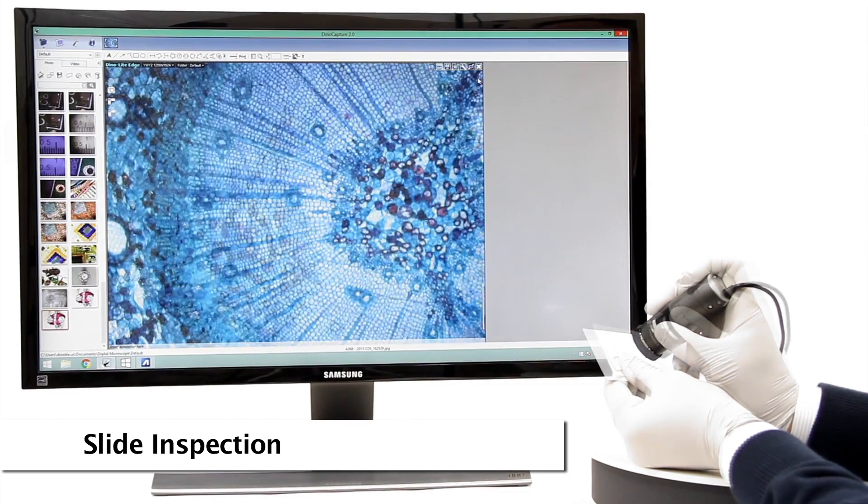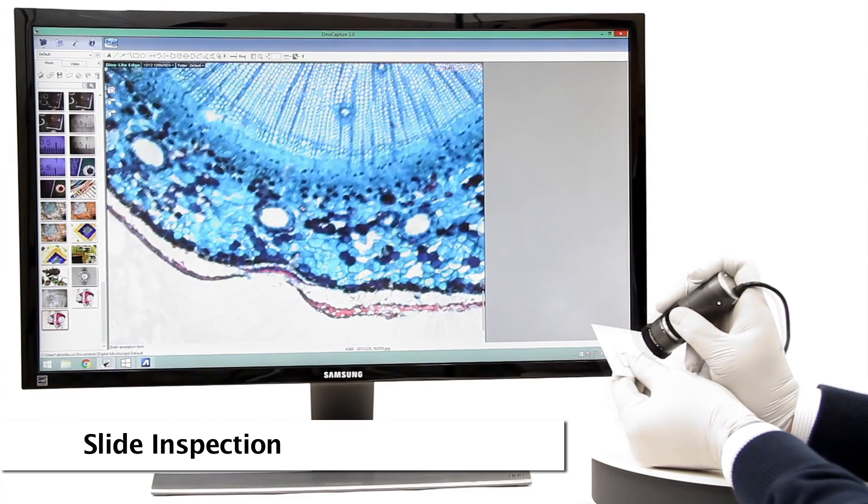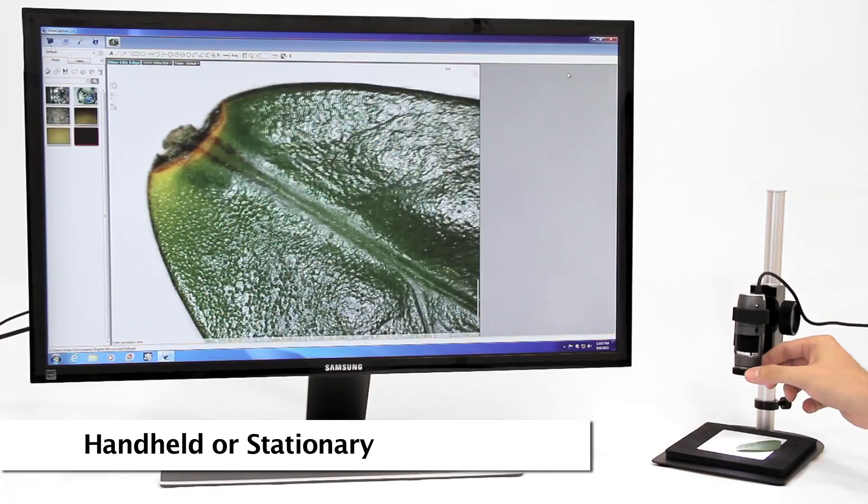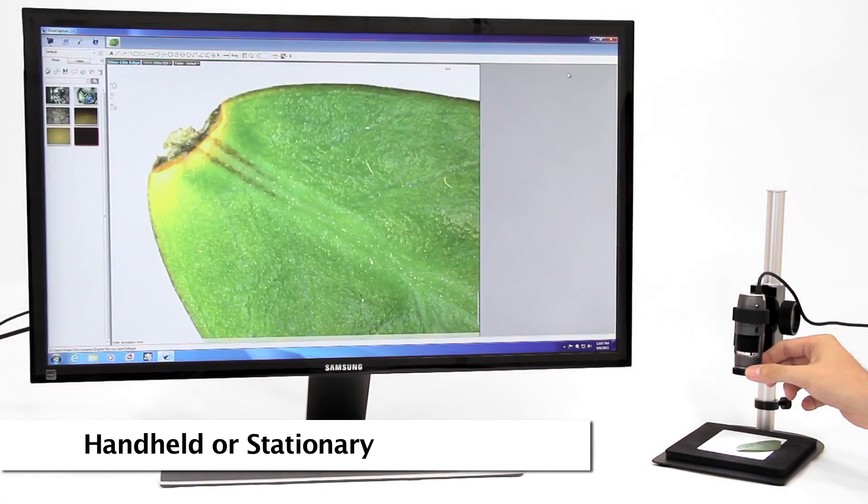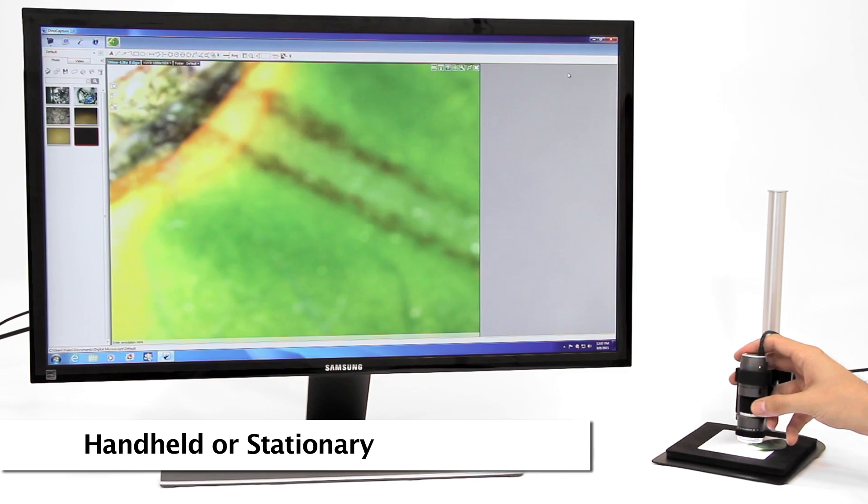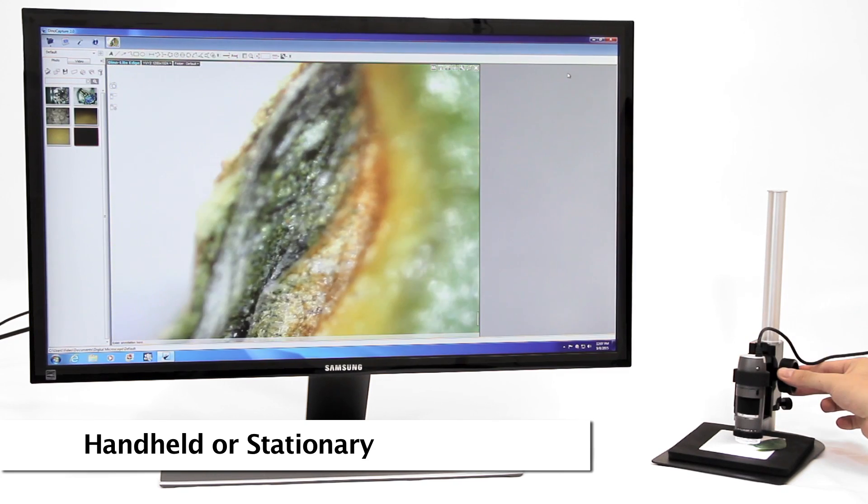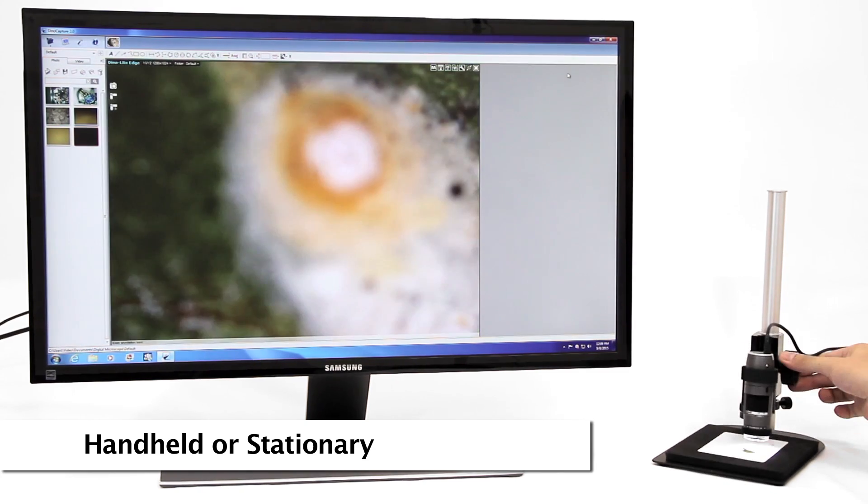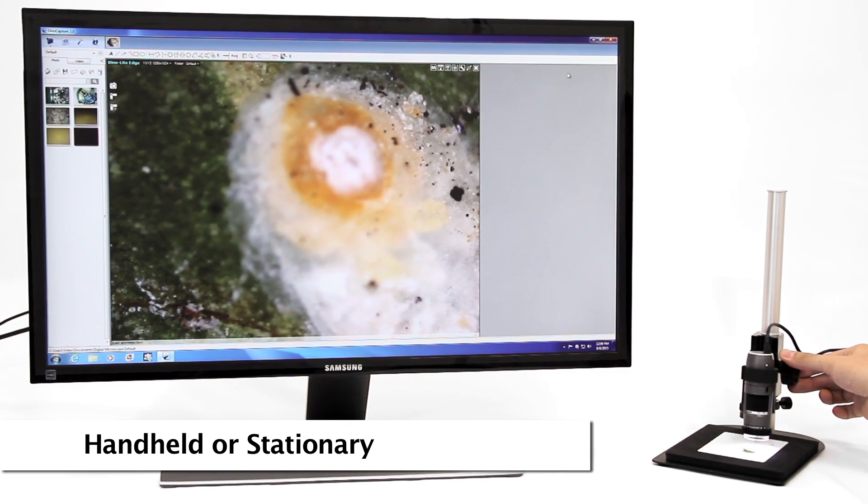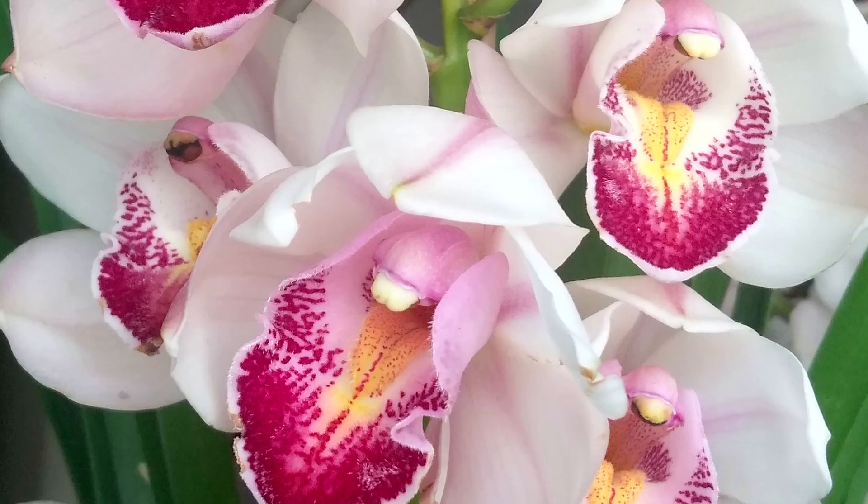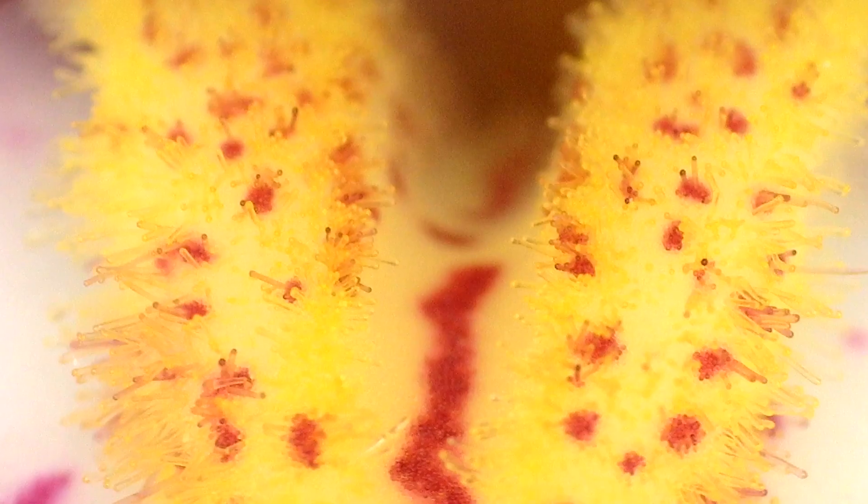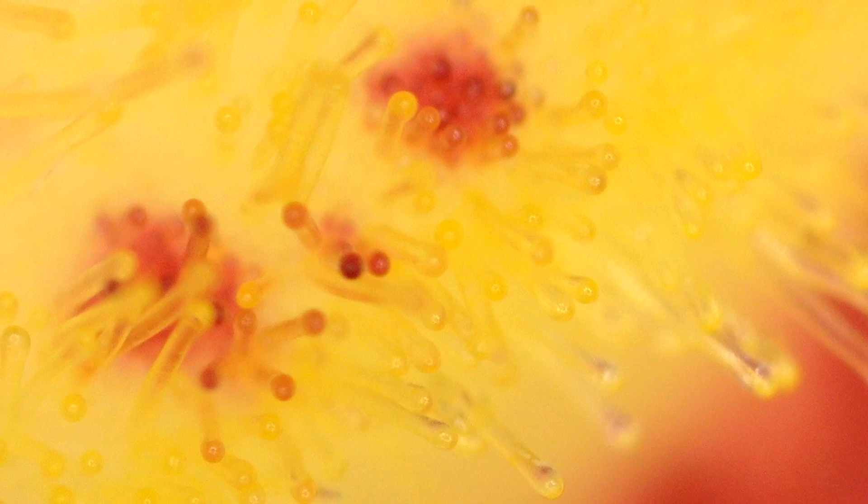The Dynolite can be easily used as a handheld microscope for quick and simple viewing and inspections of plant subjects. Using a stand is recommended for the best stability and imaging results. All of the pictures shown were captured by Dynolite microscopes.